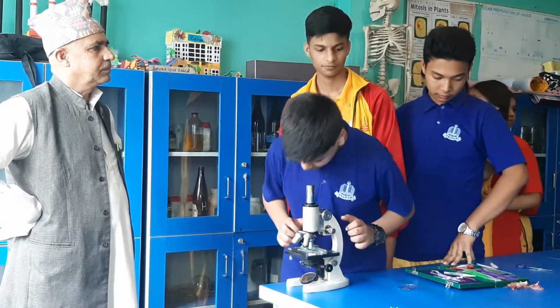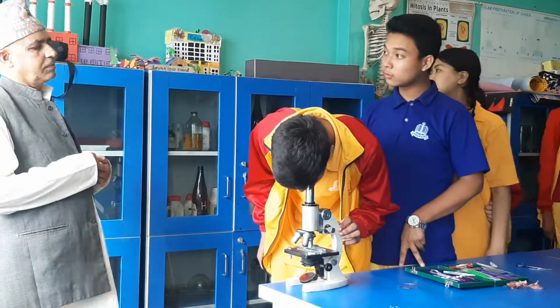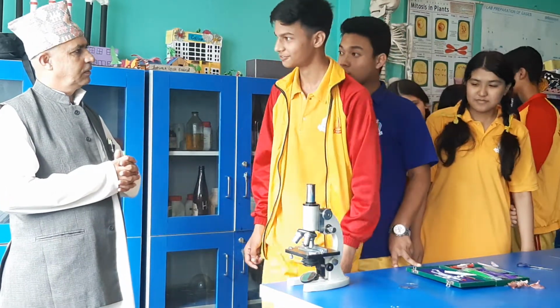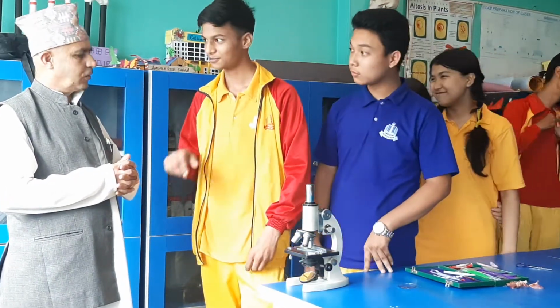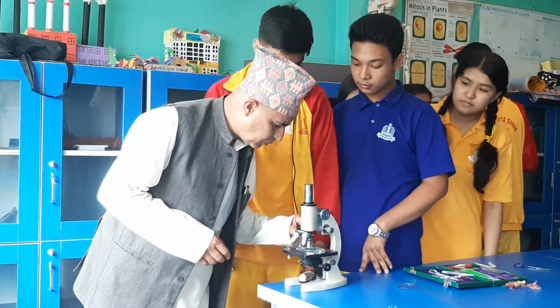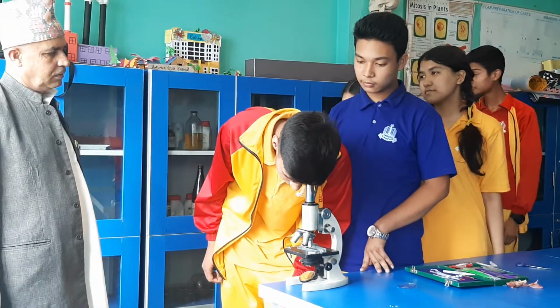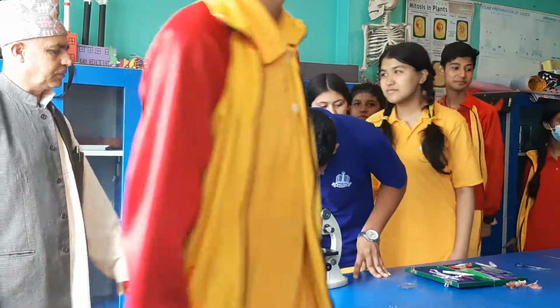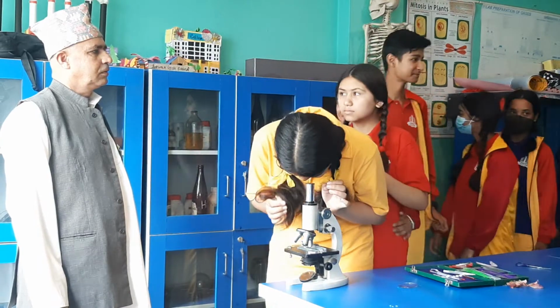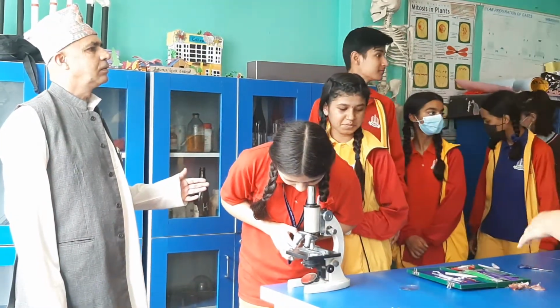You can see it. Handling of microscope is also very important job, right? What do you see? Box like this, have you seen? If not seen, then you move that. No, not this way, down this way. Make it straight.